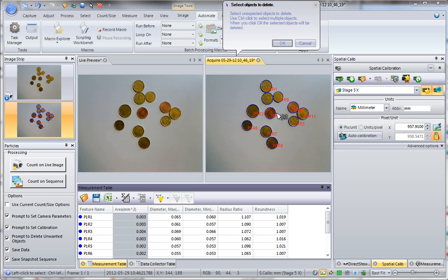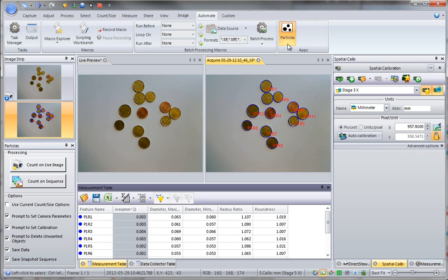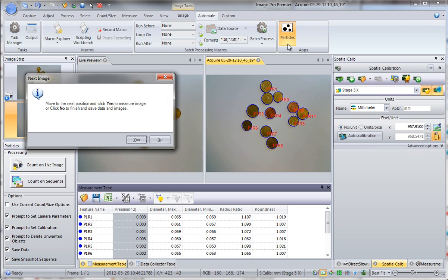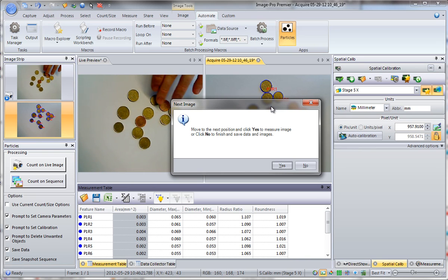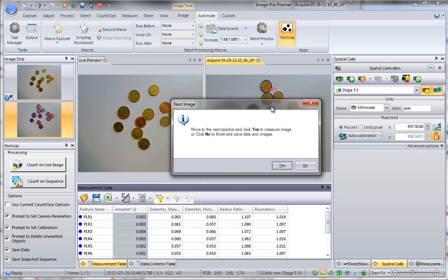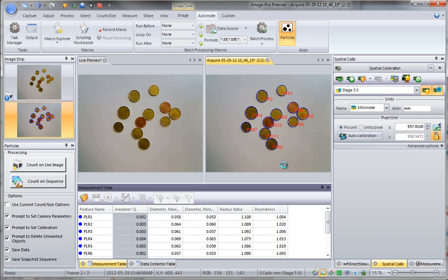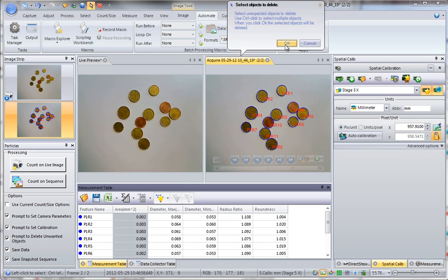You have an option to delete unwanted objects. If everything is fine, click OK. On the next stage you can move an object to a new position — I'll just rearrange it. Objects are again counted. Click OK.